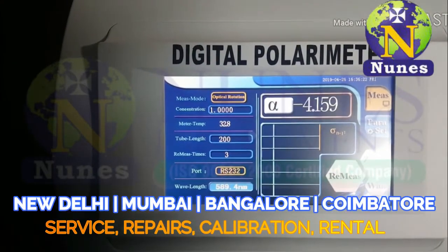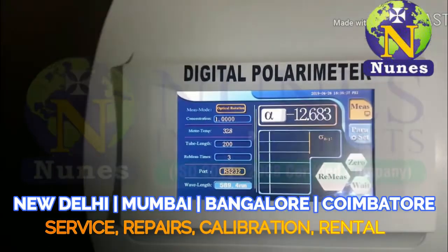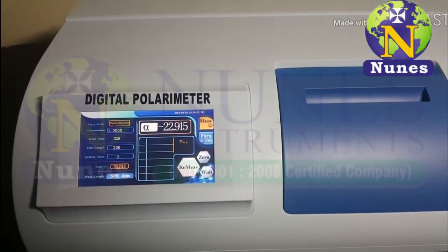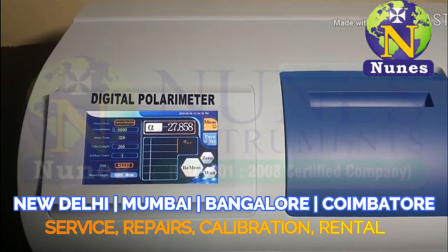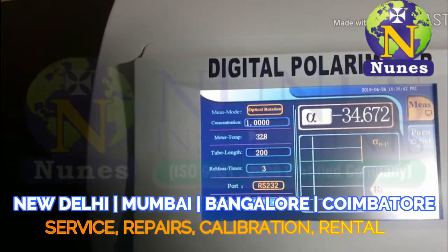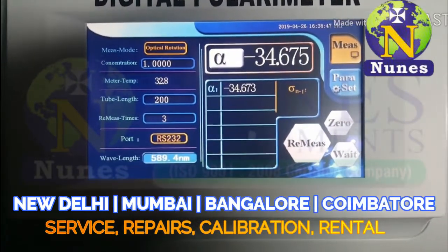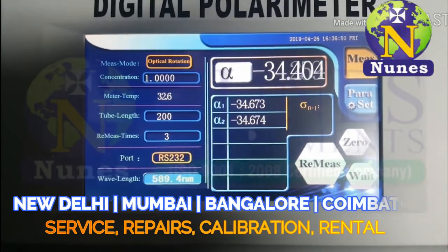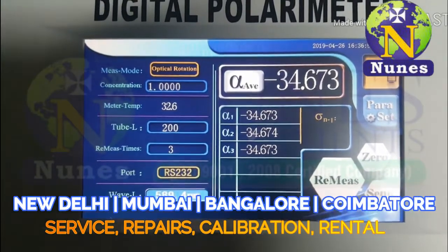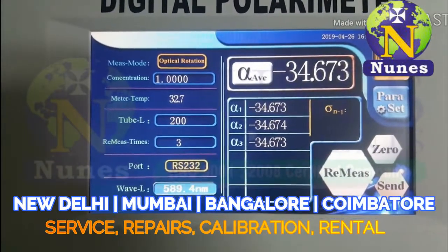The instrument will automatically detect and show the readings — no need to press any buttons. After reaching the limit, it measures up to three times, with a maximum of six times. Now we are setting three times. Second and third readings complete. The final reading average is thirty-four point six seven three.